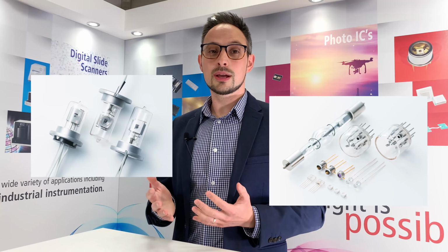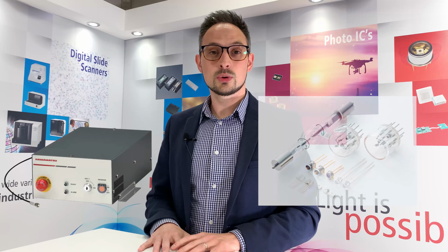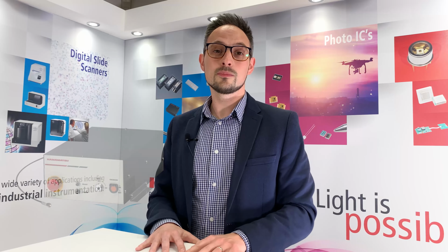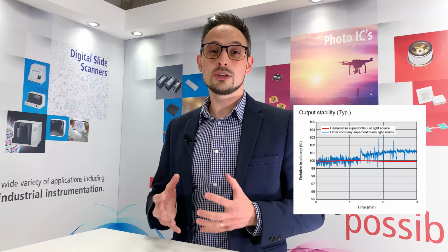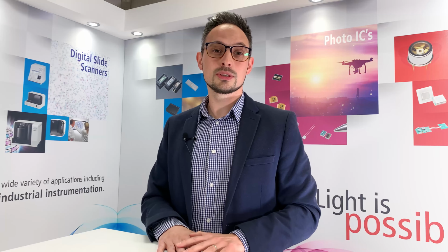That means you can use just that one light source for many applications where you need to make use of different wavelengths to interact with your samples, so that would help to reduce overall system costs. Typical broadband sources include deuterium lamps, which are high-intensity UV lamps, xenon lamps, which are long lifetime lamps with varying intensities for UV, Vis and NIR, or supercontinuum sources, which are high-intensity laser-based sources, again for UV, Vis and NIR. And Hamamatsu's new NIR supercontinuum source offers industry-leading stability to help give you the most accurate measurements.